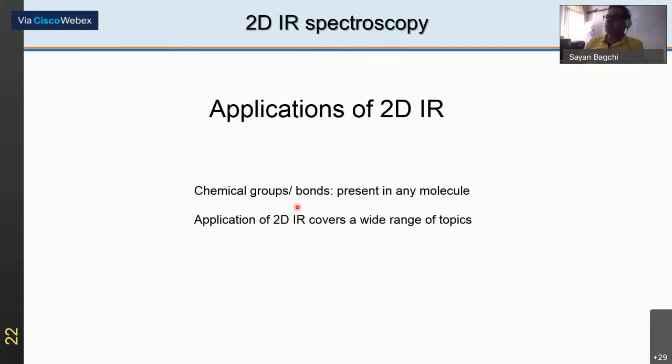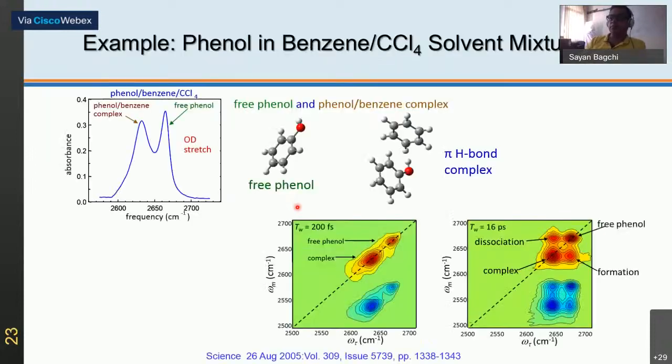of these exchange processes. For the first time ever, people could see this hydrogen bond making and breaking, or the transience of these interactions, which you always assumed or looked at from a simulation point of view, a theoretical point of view. I also will give some examples in other complex environments in biology. So the first example I will take was published in 2005 in Science.